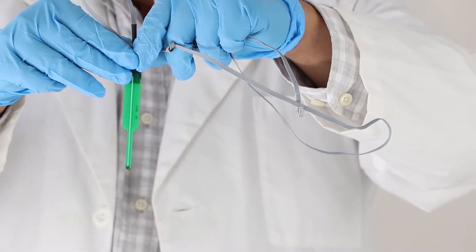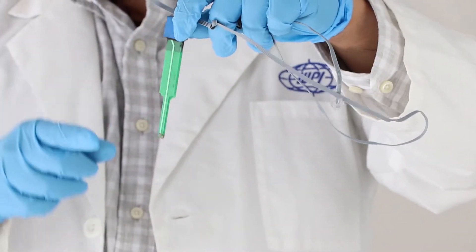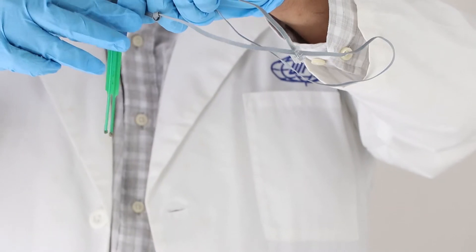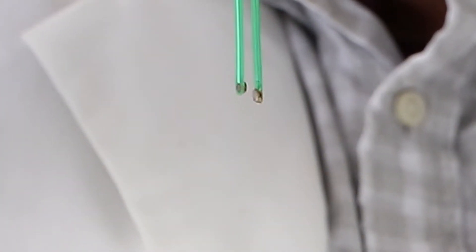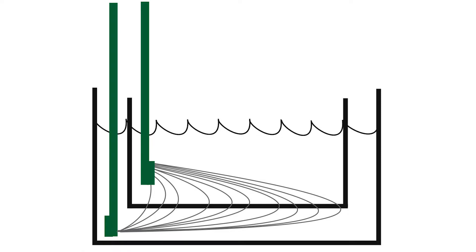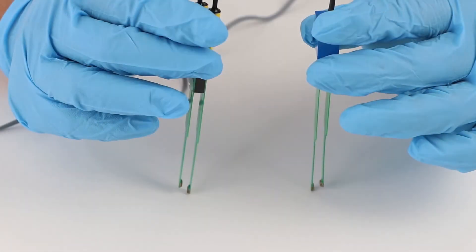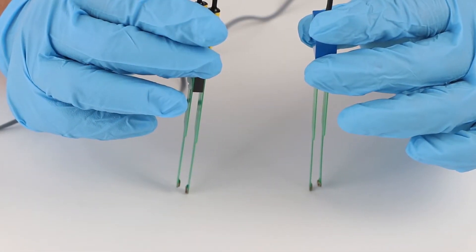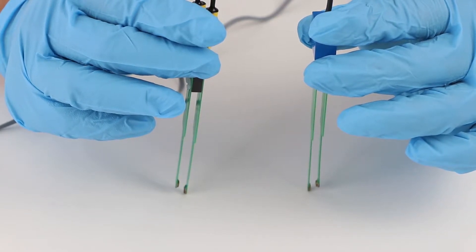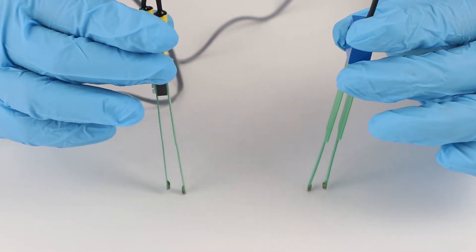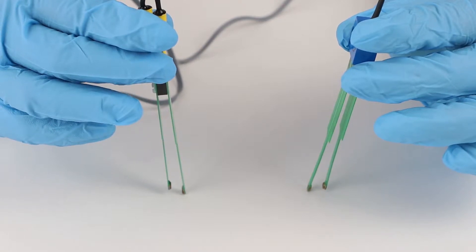The basic electrode is the STX2. This chopstick style electrode has one long and one short leg. The outer electrodes pass the current and the inner electrodes detect the voltage. While measuring, be sure to hold the electrode vertically. Tilting the electrode may affect resistance measurements.